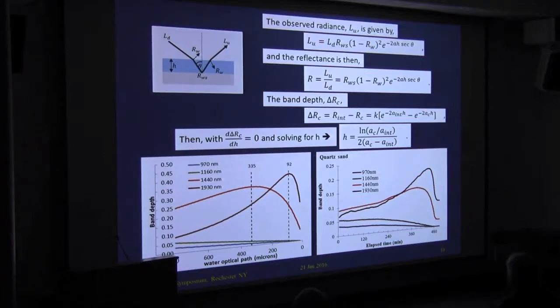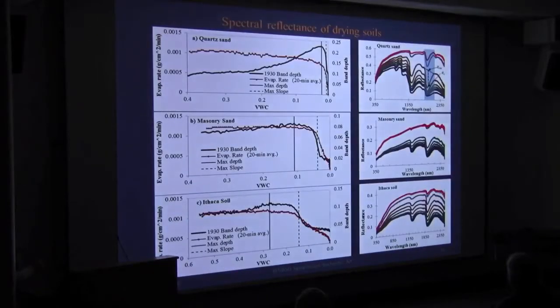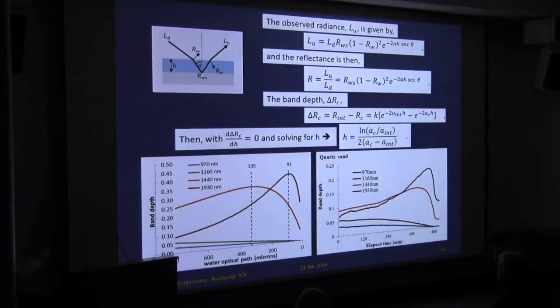Well, probably what's happening is that the bulk of the water has gone right in here. The water is adsorbed onto the particle surfaces. It's not in the pores anymore, and that's what we're seeing. And that's where we're getting this very thin layer of water.